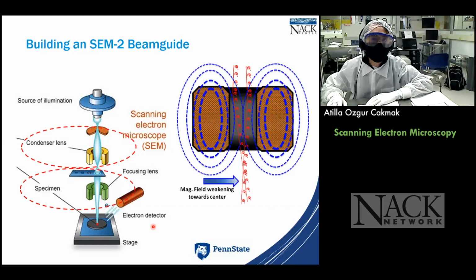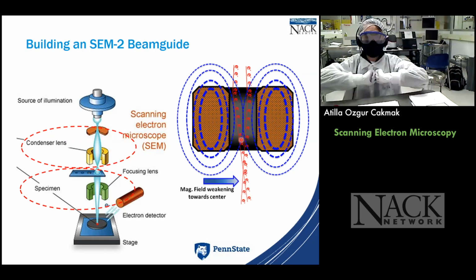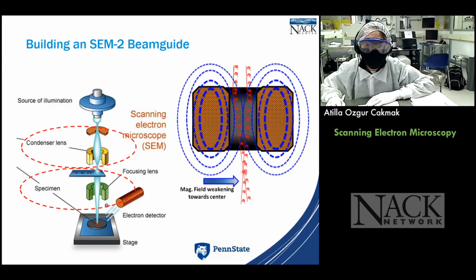the magnetic lenses come into play, like I was saying earlier. Take a magnet, just like the optical counterpart, and try to focus the beam. Focus, this time, the electrons. Electrons are coming in. What are they going to do? They're going to see this magnetic field, the magnets, and they're going to alter their trajectory, because the magnetic field will apply a force onto the electron, and you can focus them at the end.